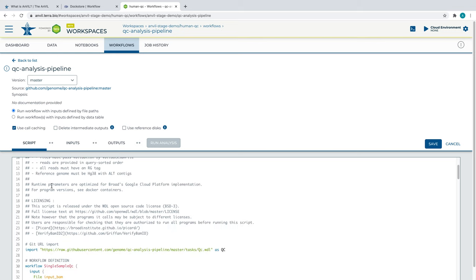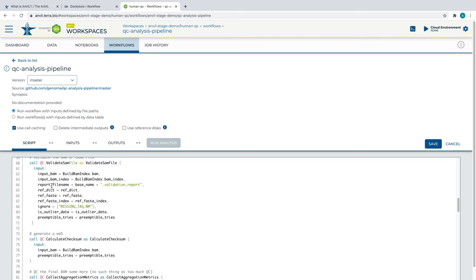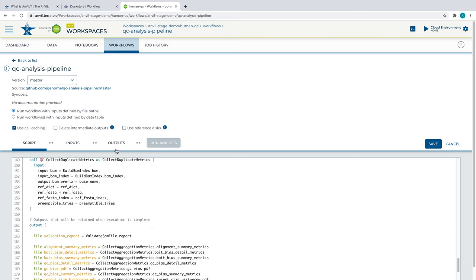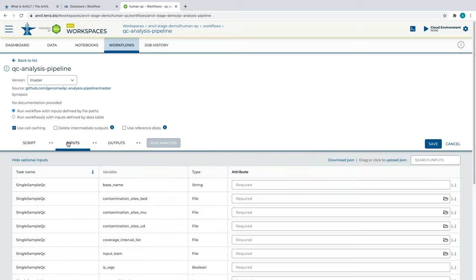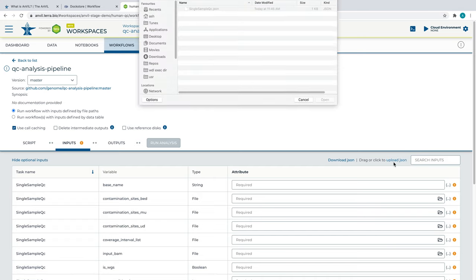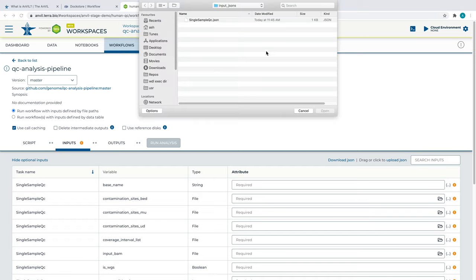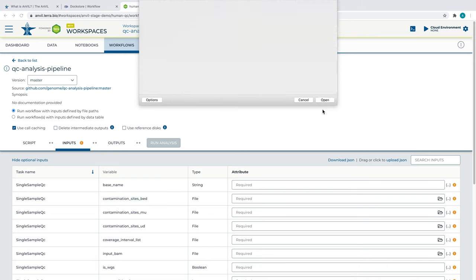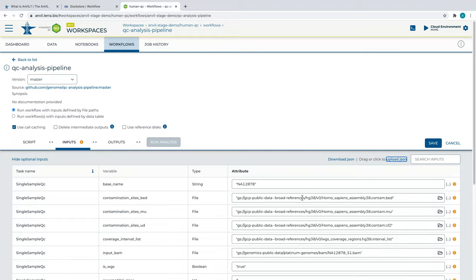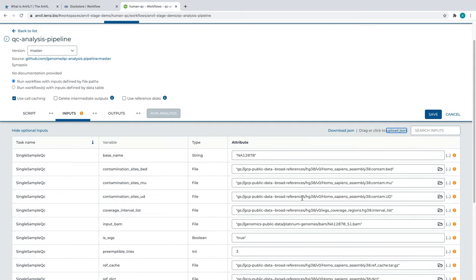We will be using a JSON we downloaded from DocStore earlier to provide example inputs into our workflow. If your data is already inside Terra, it is not necessary to import a JSON like this, but it can still be a useful test case.